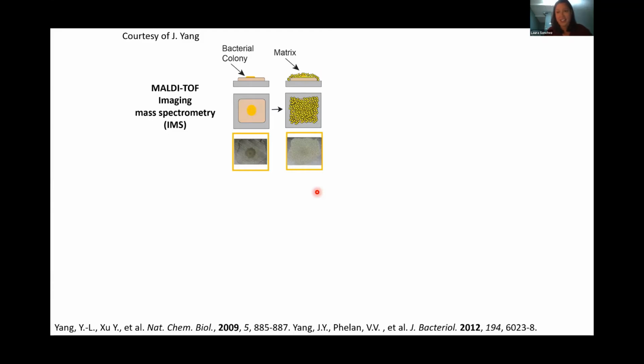The other context for this talk is thinking about what tools we have to look at chemistry through bacteria. I removed the movie from this, but just to walk everybody through, because you'll see why this is important later when we adapt the technique, this is what everything was built off. In Pieter's lab, we did a lot of MALDI imaging mass spectrometry. Since this is a mass spec group, I'm not going to say the full name to save time. Basically, we would grow bacteria or fungi on thin agar.